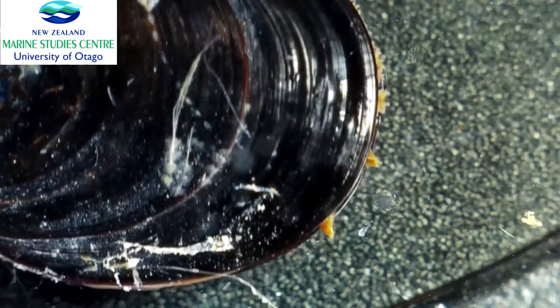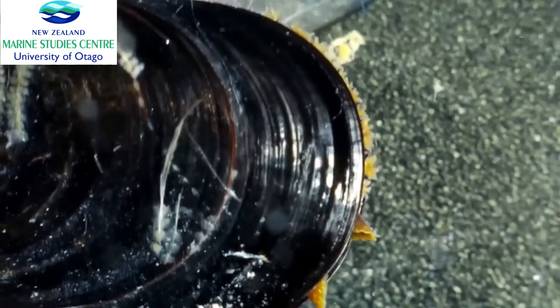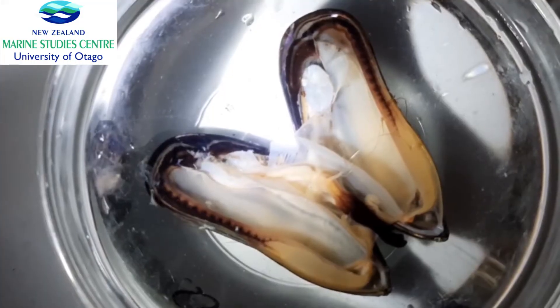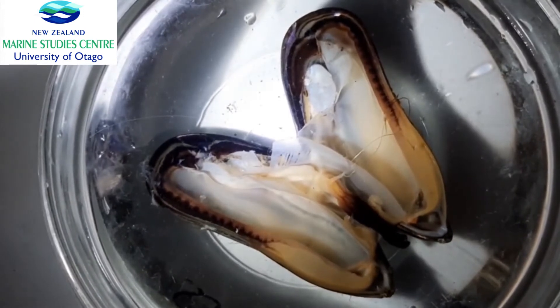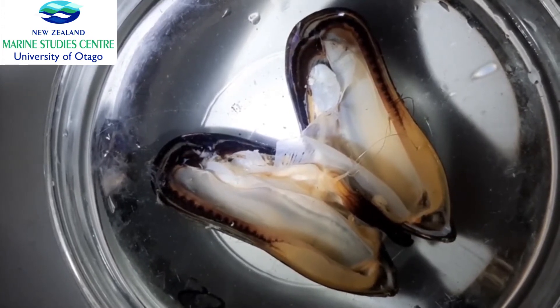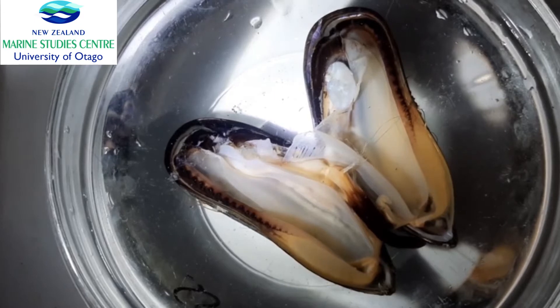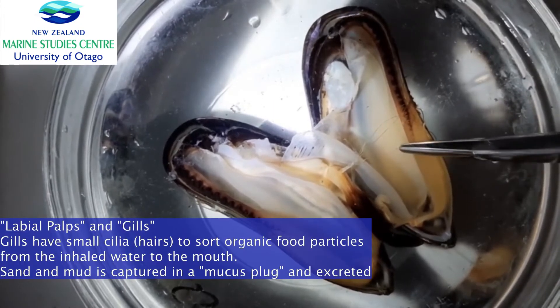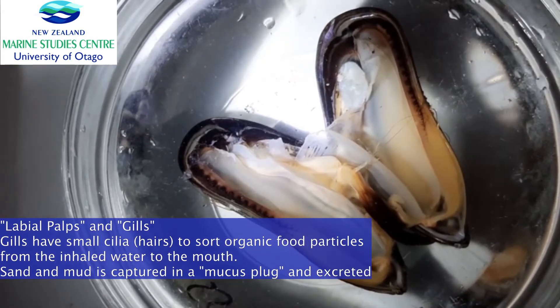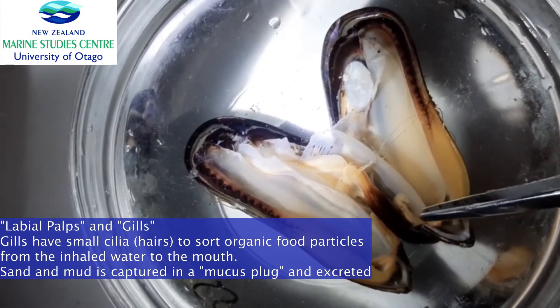You can see that particles coming by the exhalant siphon are pushed out into the water, while those that come close to the feathery inhalant siphon are drawn into the mussel. A mussel such as the green lip mussel can filter up to 9 liters of water an hour — that is a lot of water. Mussels are quite selective about what they eat: the labial palps and the gills sort through whatever particles come in, and most material such as mud and sand is bound up in a mucus clump and excreted.